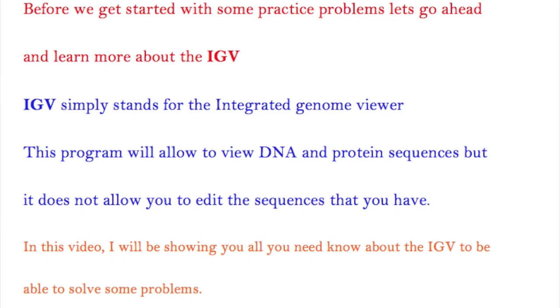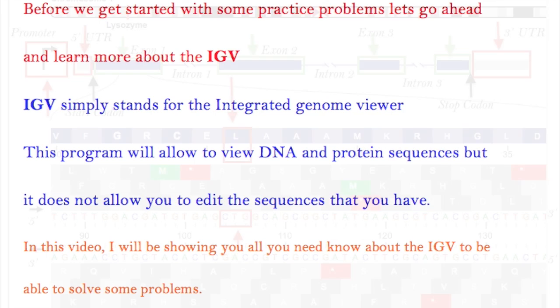Before we get started with some practice problems, let's learn more about the IGV. IGV simply stands for the Integrated Genome Viewer. This program will allow you to view DNA and protein sequences, but it does not allow you to edit the sequences that you have. In this video, I'll be showing you all you need to know about the IGV to be able to solve some problems.